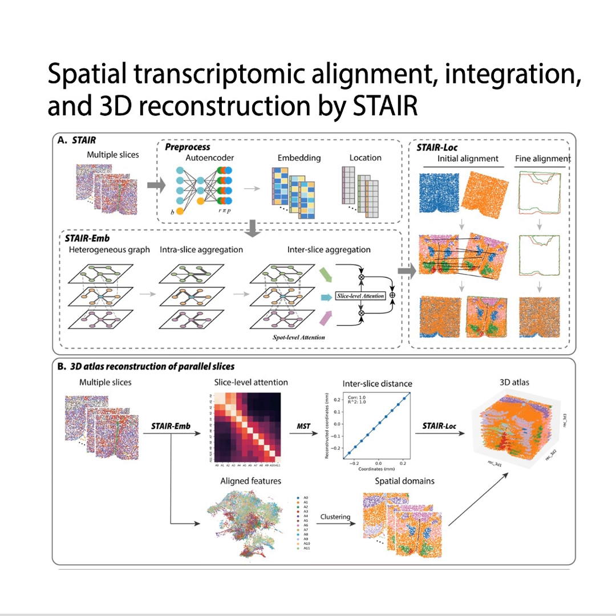And the 3D reconstruction provided the final piece, heterogeneity along the z-axis. The tumor invasion wasn't just a flat process. That's right. The 3D view revealed that the most aggressive regions, the invasive cancer and that in situ cancer 1, showed a distinct trend of progression from slice H3 up towards slice H1. This interslice heterogeneity is the crucial context we miss in a 2D slide. It shows how the disease is spatially invading the tissue in 3 dimensions.